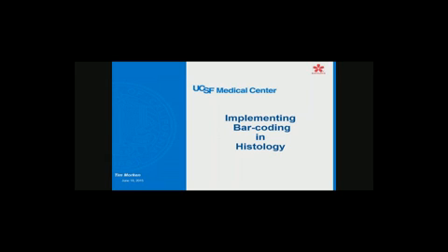This is something that has been talked about for a long time. People have talked about how barcoding would be so great, and there have been a lot of presentations at NSH and other meetings about why barcoding is such a great thing. But what I wanted to do is, we went through the process of implementing barcoding in our laboratory, and I wanted to give the process of actually implementing it rather than just talking about how great it is. So that's what this presentation is about.